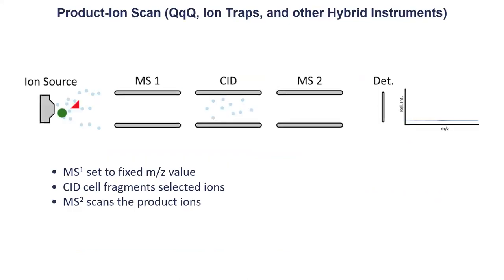And then another thing you can also do, of course, is you have an ion trap here in this case. So you can not only select one mass-to-charge ratio, but you can actually scan the whole range of ions, which is also very important to know.